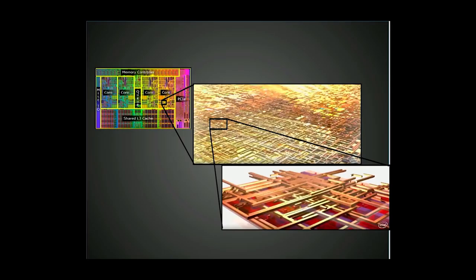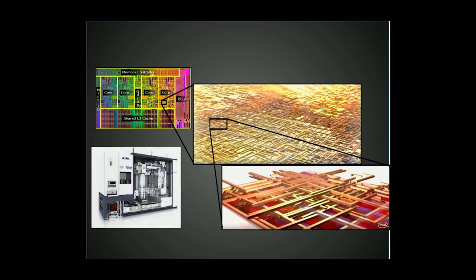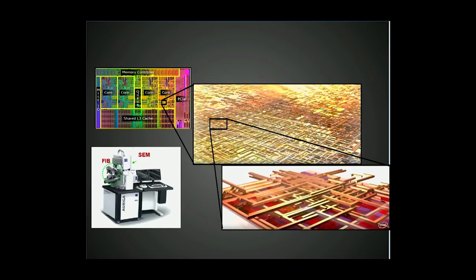Now, if you want to make it, you just need a few billion dollars, machines like this, and you're good. If you want to reverse engineer it, then maybe you could use some machines like this as one example, which I'll be discussing in more detail, called a FIB-SEM.